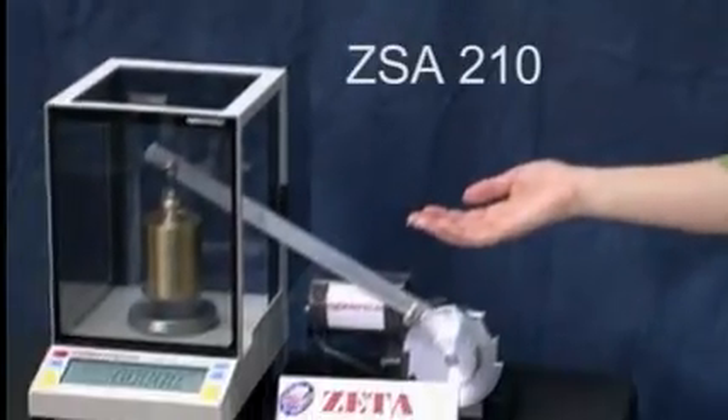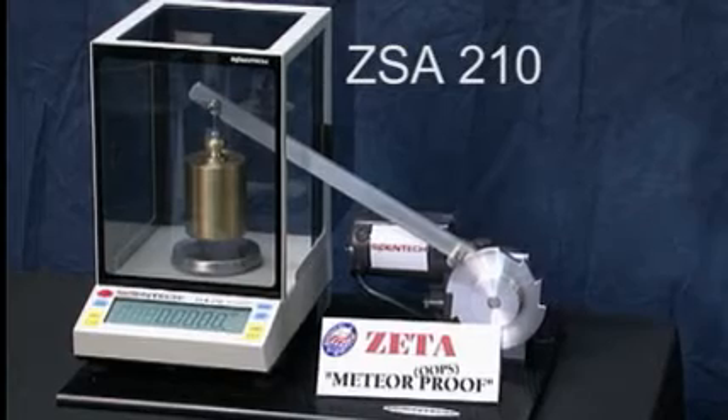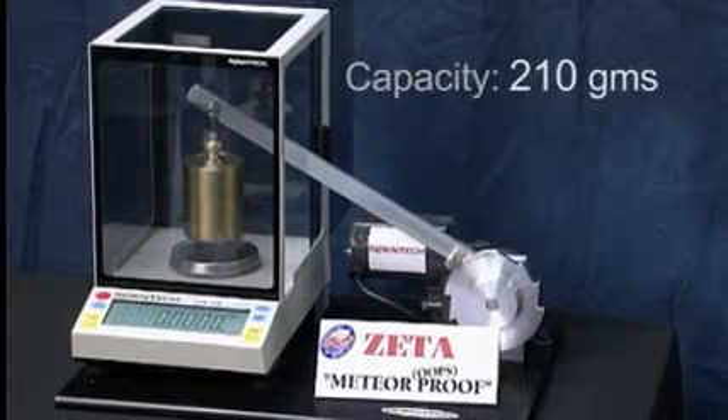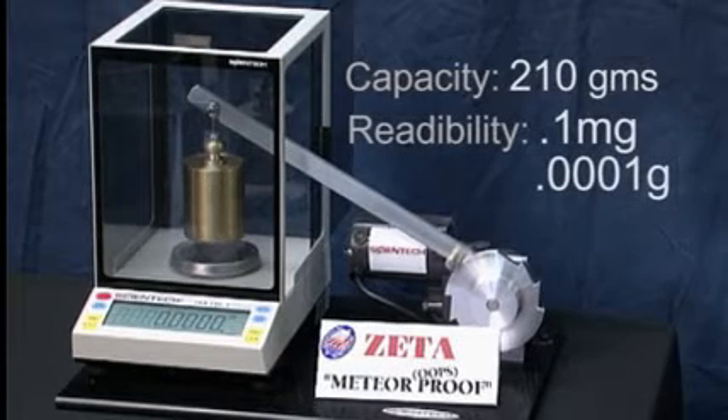The Scientec Zeta series are high-performance analytical balances with rugged weighing sensors. Here we see a Zeta model ZSA-210 analytical balance. The ZSA-210 has a capacity of 210 grams and a readability of 0.1 milligrams — that's four decimal places.